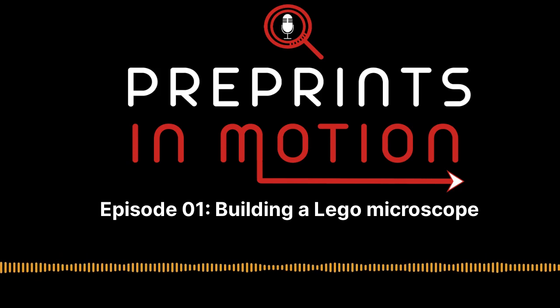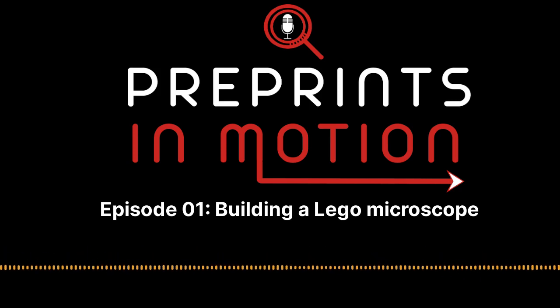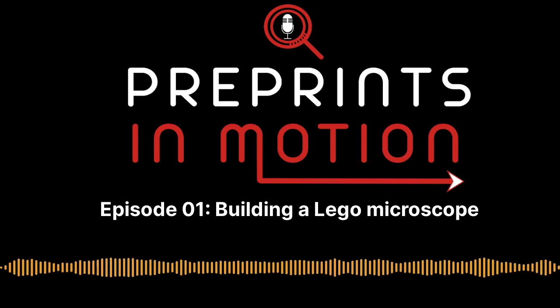This week we sit down with Dr Bart Vos to talk about his recent preprint designing a high-resolution Lego-based microscope for an educational setting. Welcome to the show. Thank you very, very much for joining us.